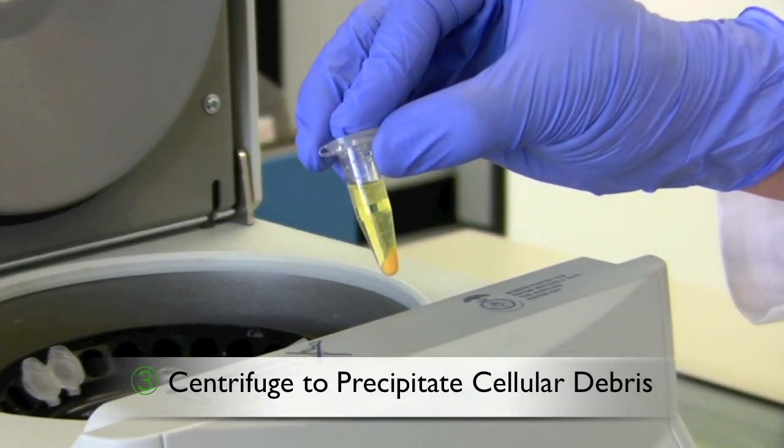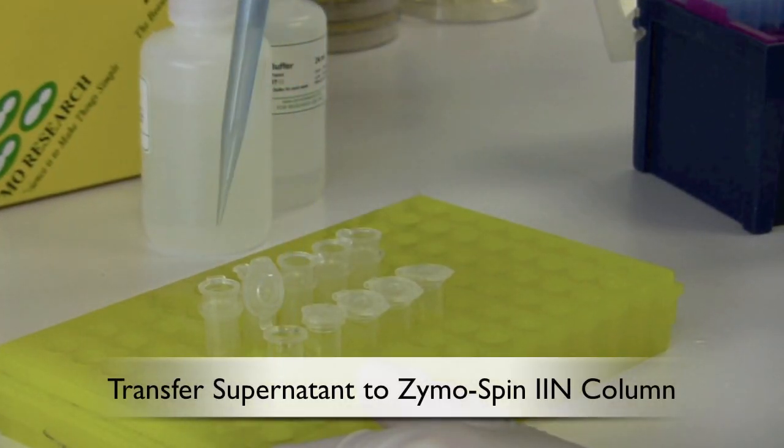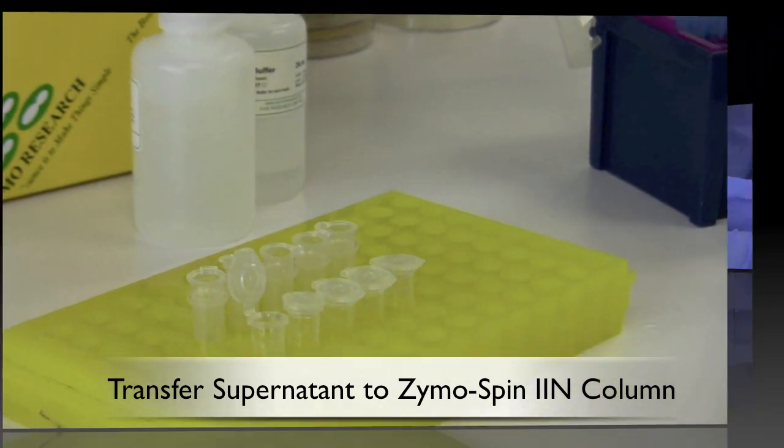spin down the debris in your tabletop centrifuge. After centrifugation, transfer the supernatant into the Zymo spin column.